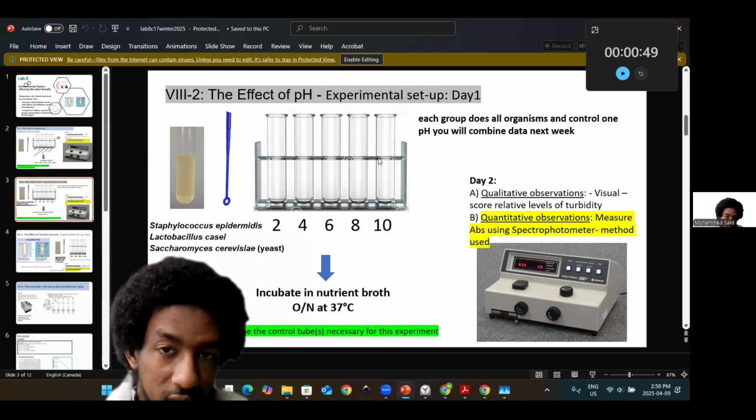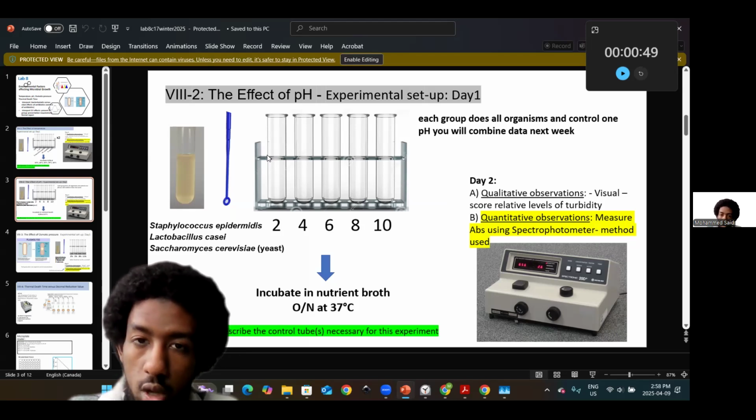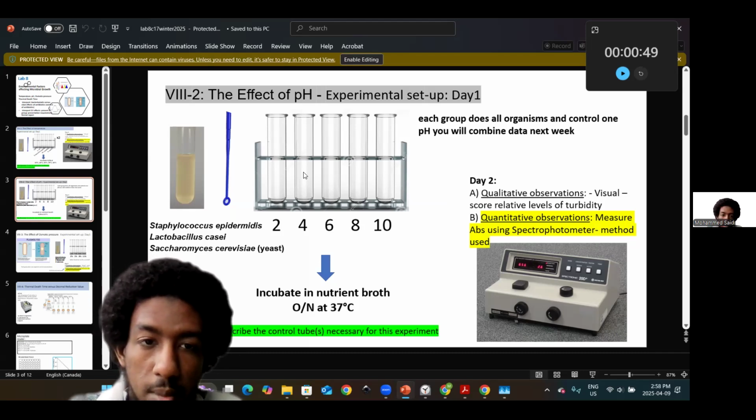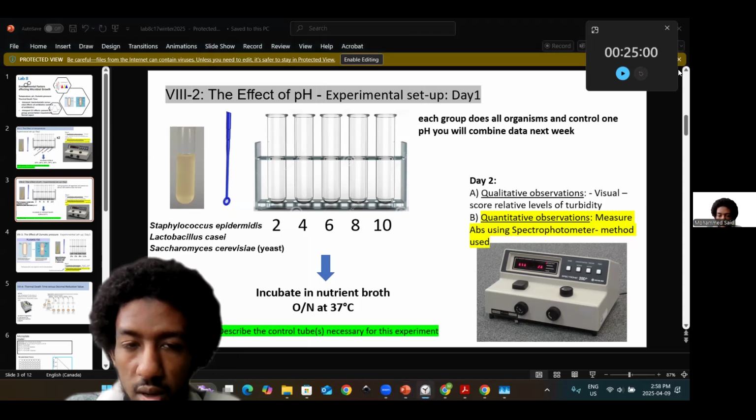And then what do you expect in terms of growth, generation time, turbidity, and consequentially the change in growth across pHs? This could be one of the questions that you want to respond to, the impacts that temperature, pH, or the following slide, have in turn on the growth of your bacteria.